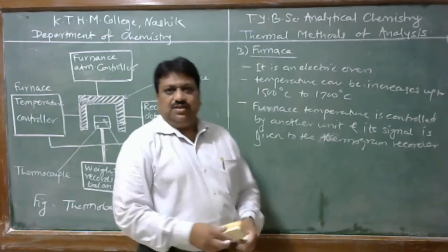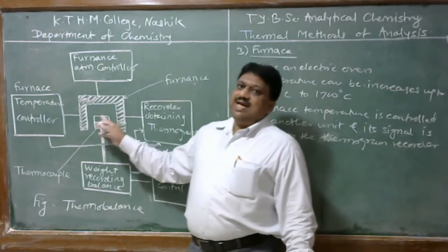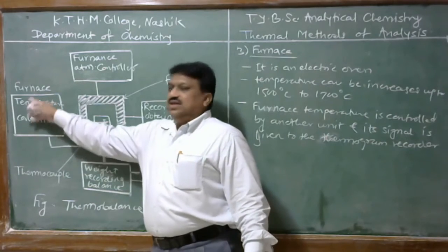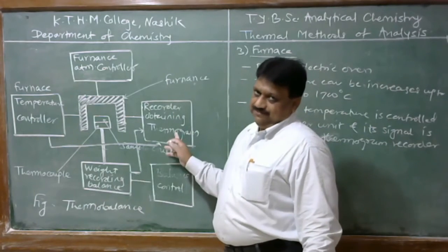Therefore, the function of this furnace is to heat the sample linearly as well as sometimes in a programmed manner. Temperature of the furnace is controlled by this unit, and this unit is connected to the recorder.